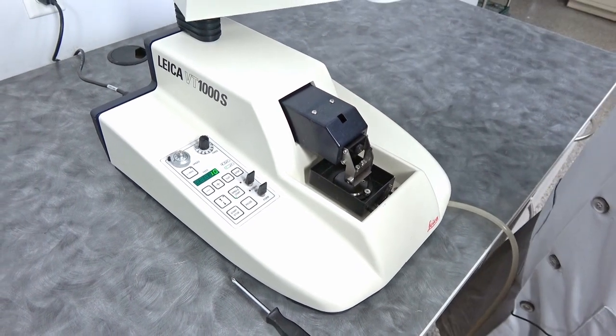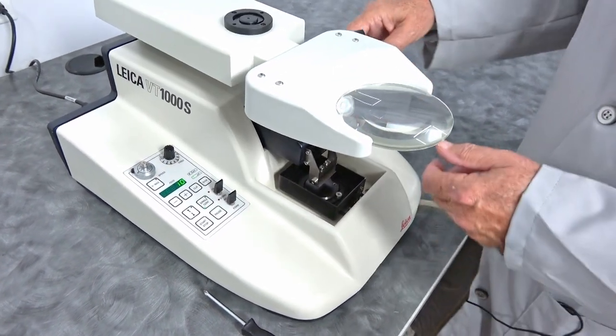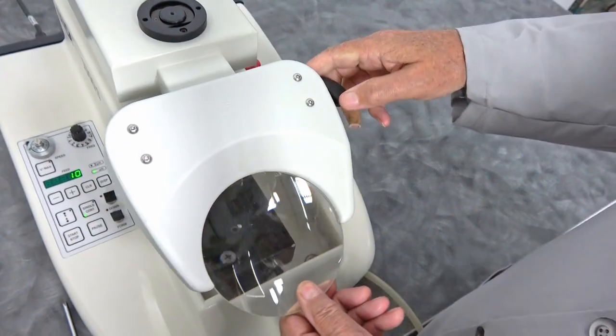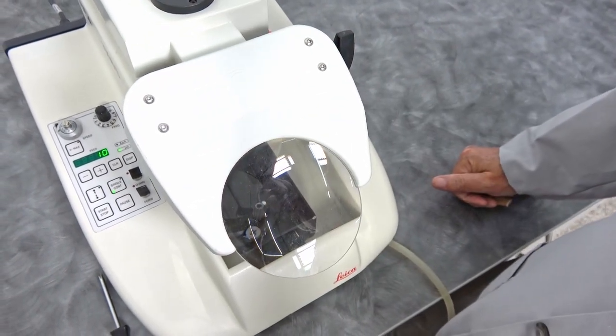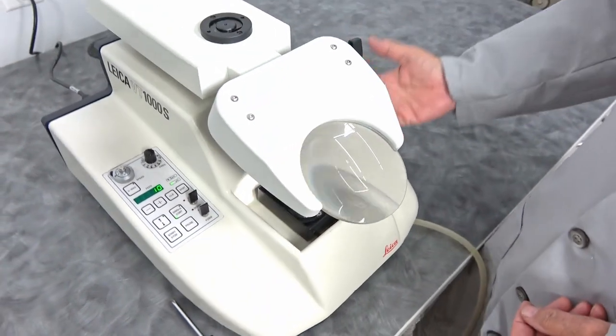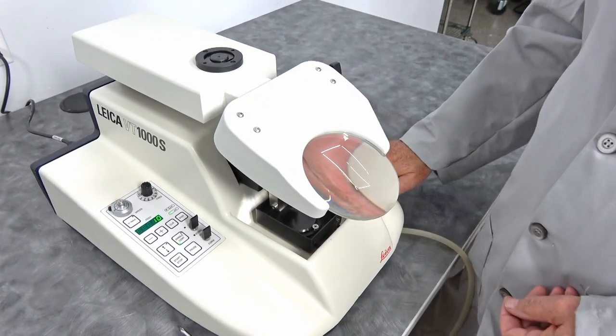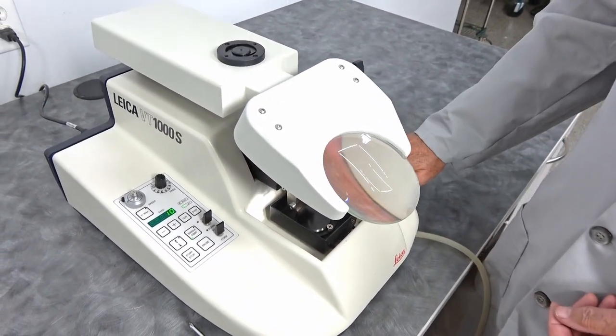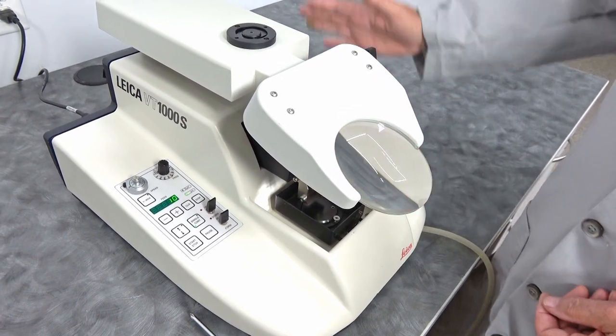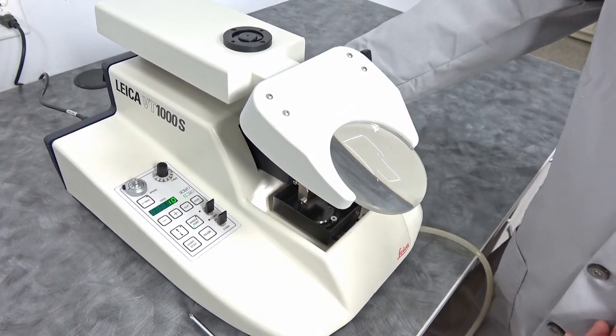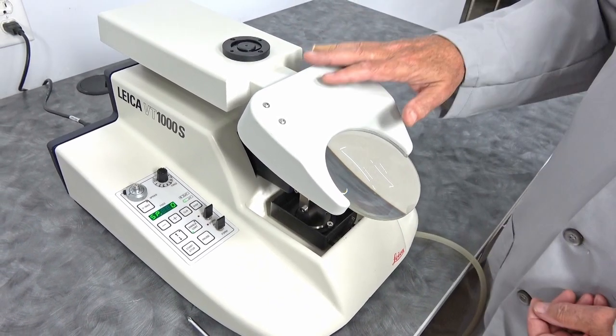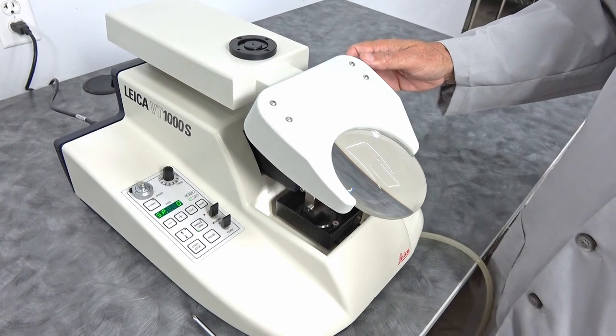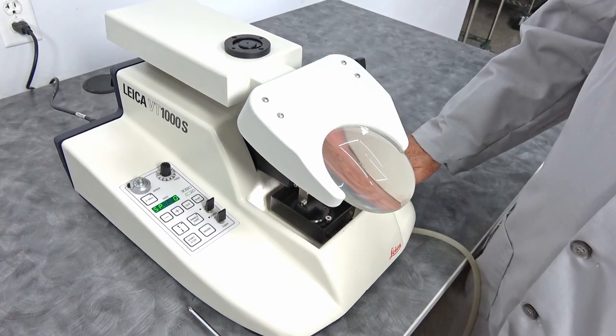There is an emergency stop so you can take a look at how well your cut is. You have the magnifying glass. There are light options available for these. This unit does not include one, but they are available on the market. You do have an emergency stop over here in case you need to stop it right away. And that's the Leica VT-1000.